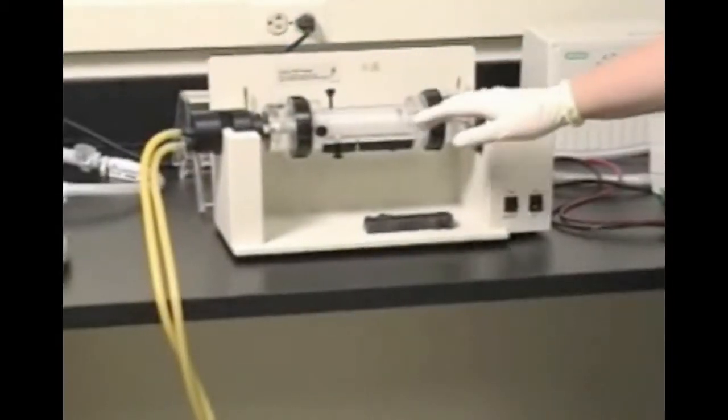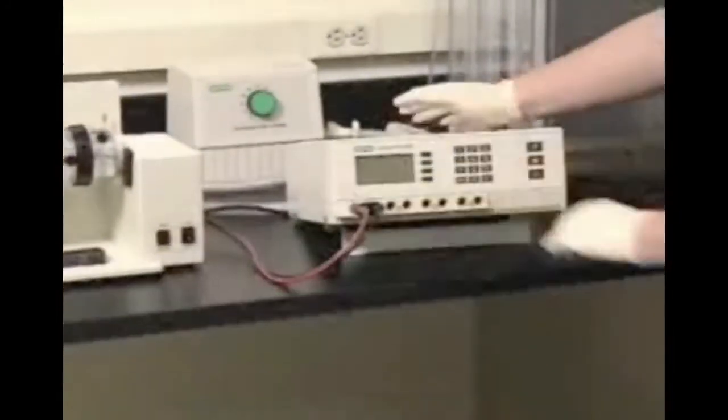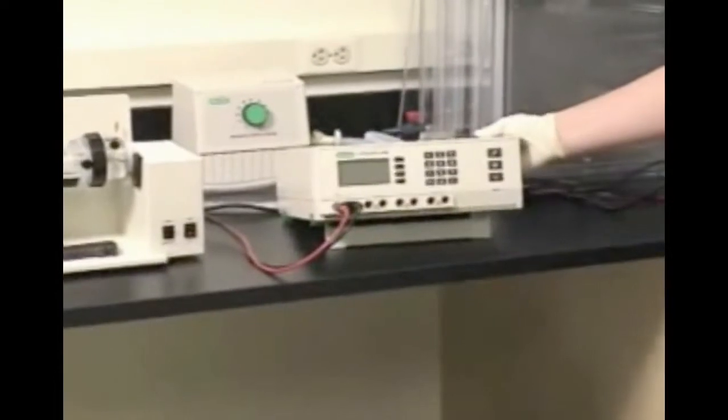Here we show the Rotifor system fully hooked up and ready for a run. You'll notice that the cooling finger is connected to a recirculating water chiller. The temperature in the focusing chamber will be approximately 10 degrees higher than the temperature of the water that flows through the cooling finger. Make sure to set the temperature of the recirculating water chiller accordingly.